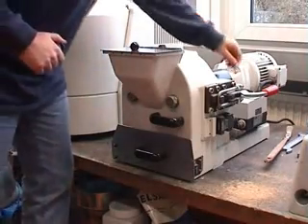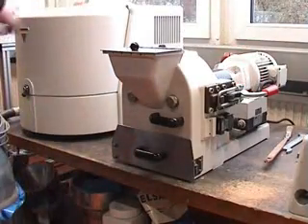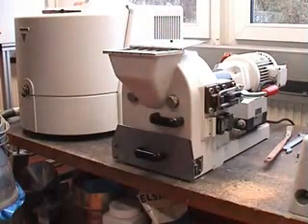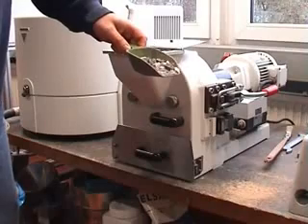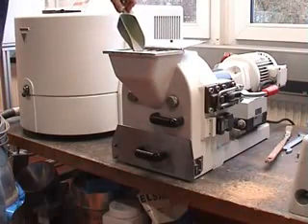Then you just have to start the operation. You open it, and now I have prepared a little bit of mineral sample, and you put that into the mill.